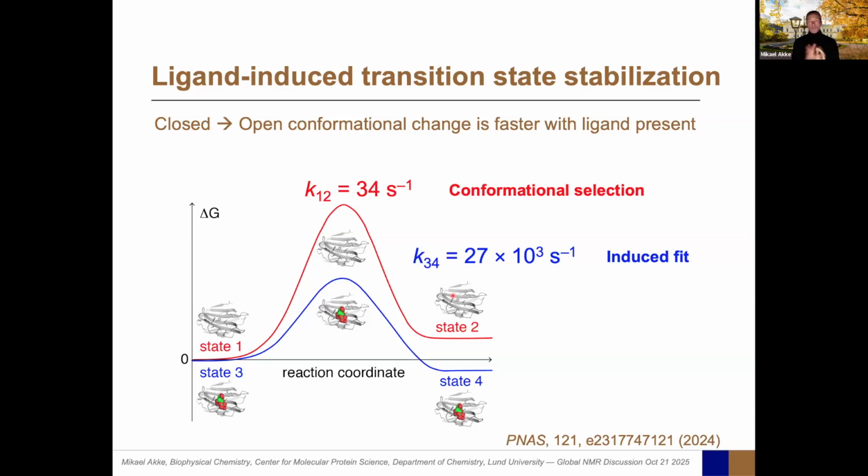And the waters are presumably organized in a way like that. And getting that concerted conformational change is a very rare event. So that's why it's a slow event, and the barrier is high. So that's how I think about it. So it's a little bit misleading if you only look at the backbone trace, which is quite similar, whereas there's presumably some change of the side chains at the same time.